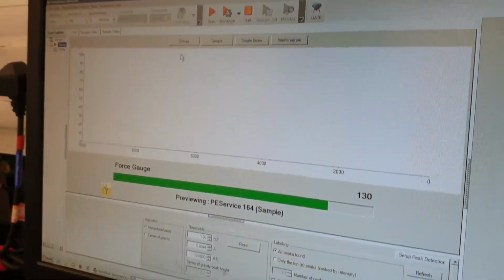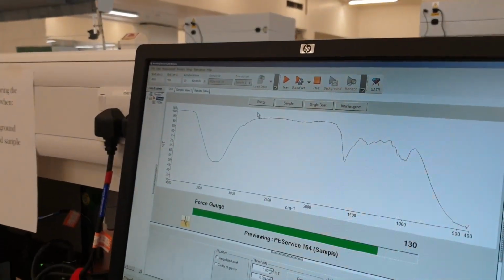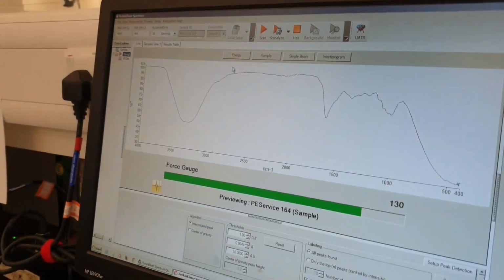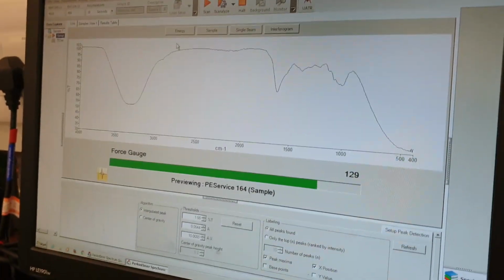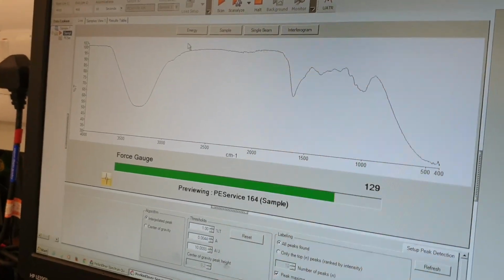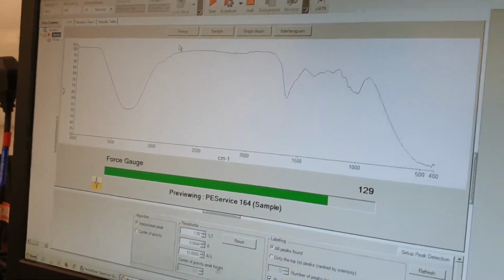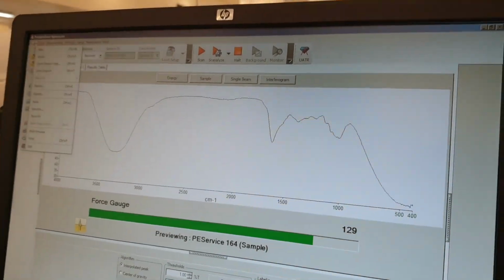And let's see what we get for courgette. We got the same as soy sauce. It's going to be pretty much the same because you just have lots of carbon bonds and OH. I wonder how its intensity compares to soy sauce. It'll overlay the spectra once it's done. You know what? We're about to find out.